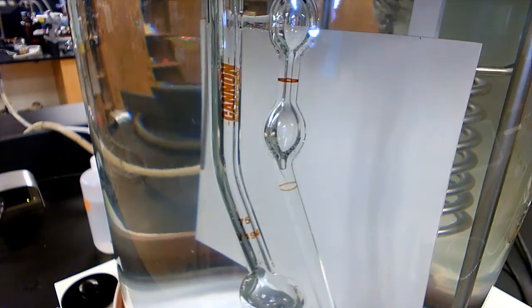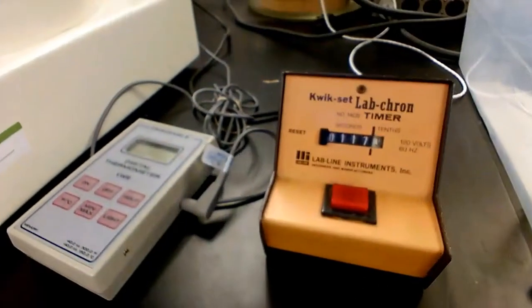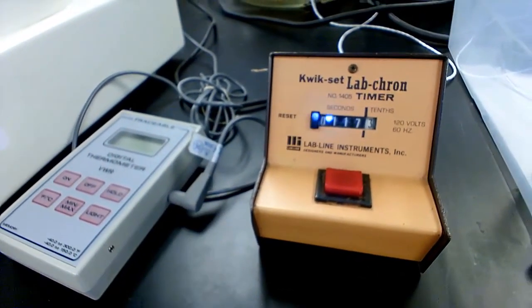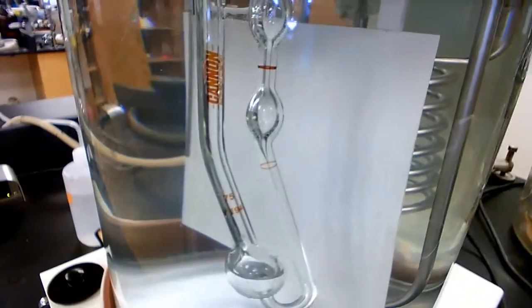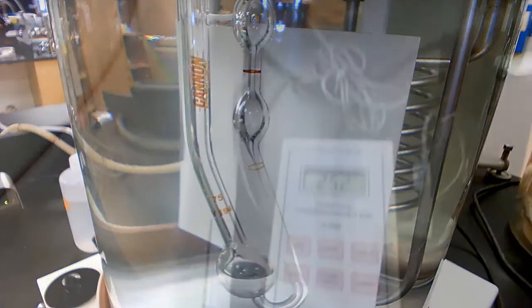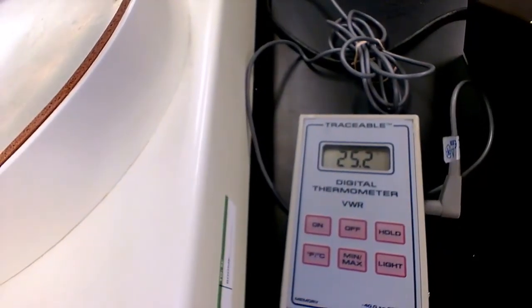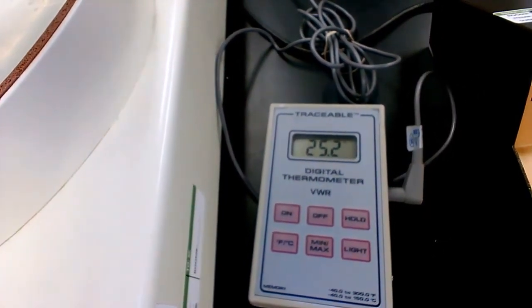We are now ready to stop our timer. The flow time of water for this viscometer is 117.3 seconds — this is our very first flow time. As mentioned, you need to redo this experiment at least two more times. Make sure the temperature of your water bath stays in range; small fluctuations are fine, but watch it closely. The temperature is now 25.2°C instead of the set 25.0°C, which is acceptable — a variation of 0.2°C is fine.